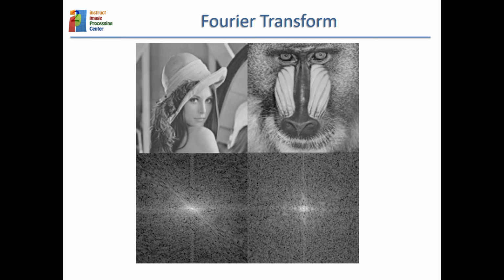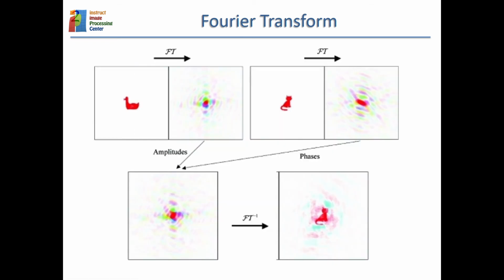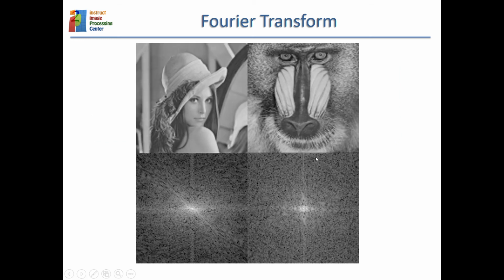But natural images, and macromolecules are kind of natural images, don't have these waves so nicely seen. So that means that you will need a continuum of all possible frequencies. So you will need a little bit of energy of all frequencies to make up the image of Lina or the image of this monkey. And we have not been talking about the phases, but the phases are also there, so you could make a similar plot now with the phases.